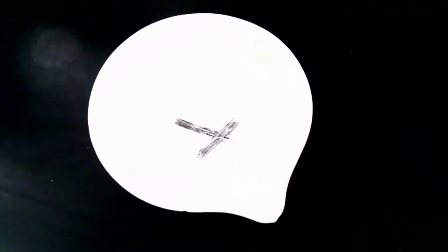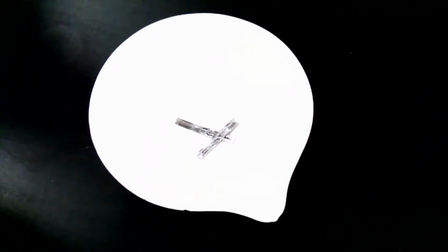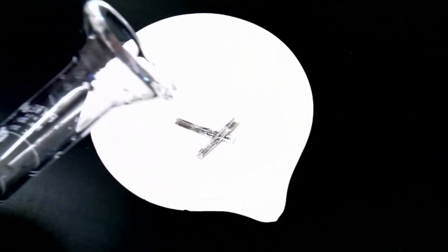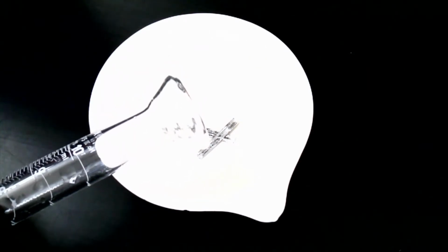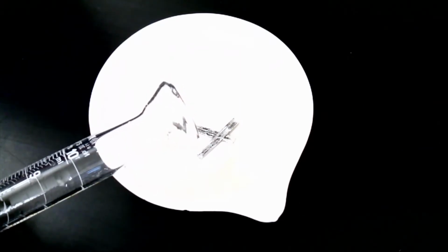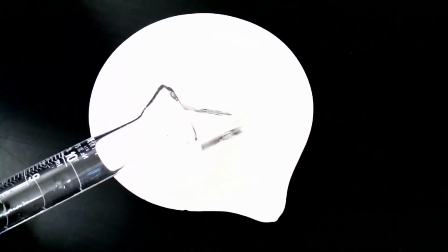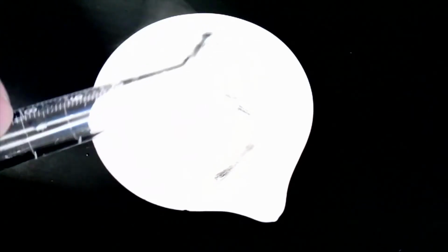And now I'm going to slowly add this. I'm going to slowly pour this HCl. Not doing this in the hood so that you can at least hear me a little bit and actually see this. Okay, I'm going to slowly pour this and let's watch what happens. Okay, so hopefully we can see, or maybe even hear, some bubbling. There's also some gases coming off, and think about what that is.